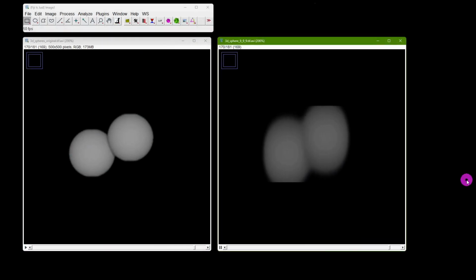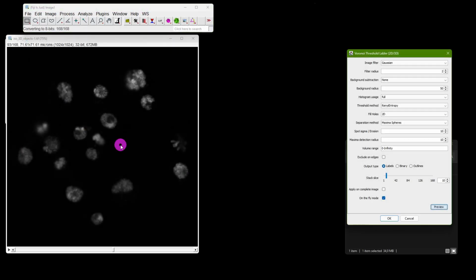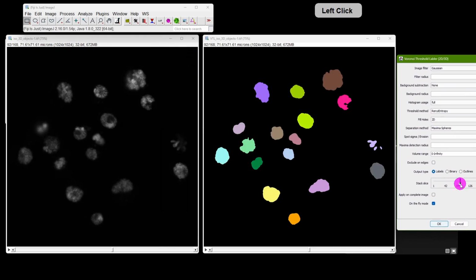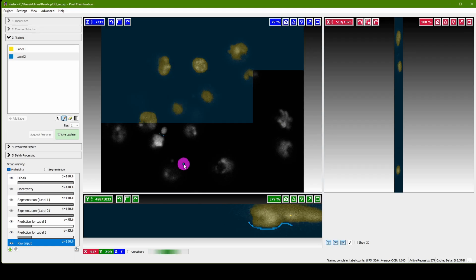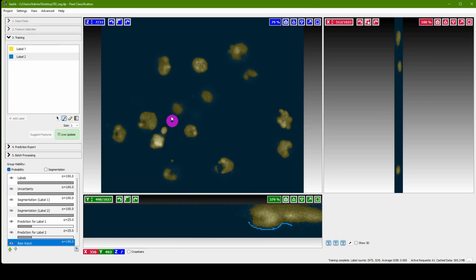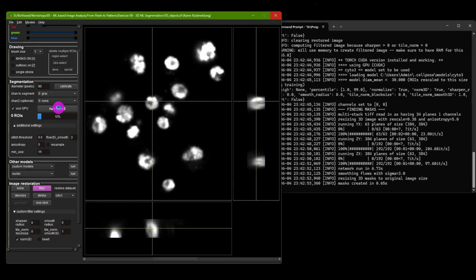In the first of two bonus sections, you'll be introduced to key considerations for 3D volumetric image segmentation. You'll learn how to avoid introducing artifacts into your analysis and how to achieve 3D segmentation using 3 different software tools, ranging from traditional methods to deep learning-based approaches.